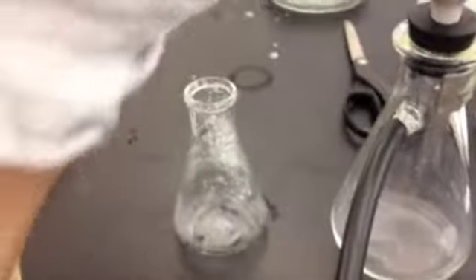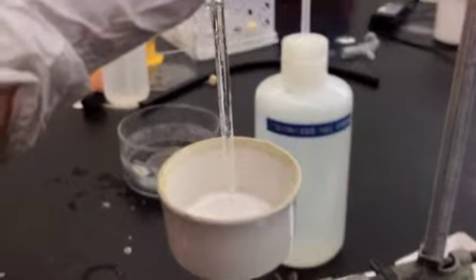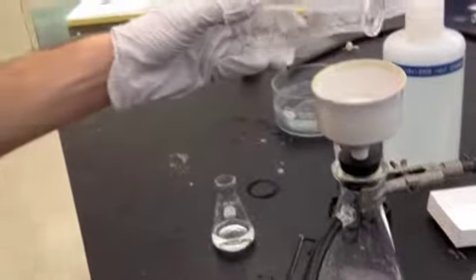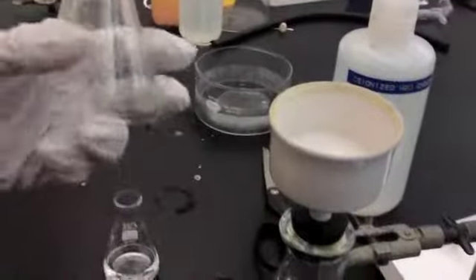Now there's still some product here on the Erlenmeyer flask, so we want to get as much product back as we can, and there's also some here on the glass rod. So I'm just going to wash the glass rod with some ethanol. Now it's off the glass rod. And finally, from the Erlenmeyer flask, just add a little bit of your cold solvent, swirl it, and try to get any remaining product off the walls onto your filter paper. So for the most part, it looks like the flask is clean. Now if you look on the filter paper, it's kind of hard to tell.